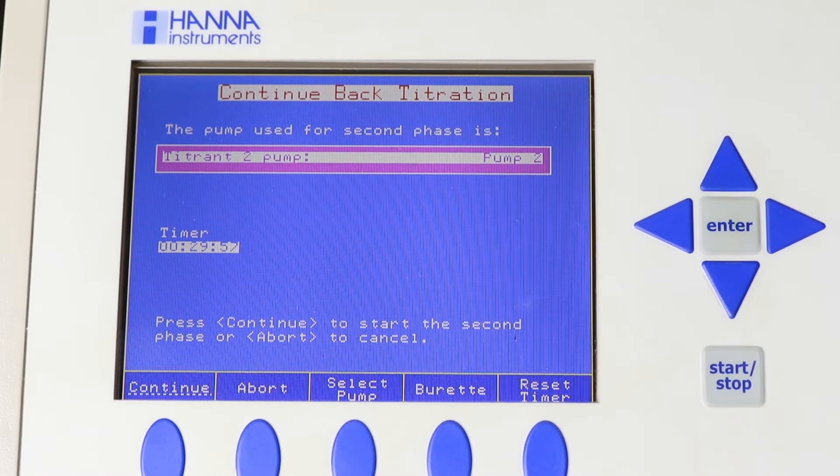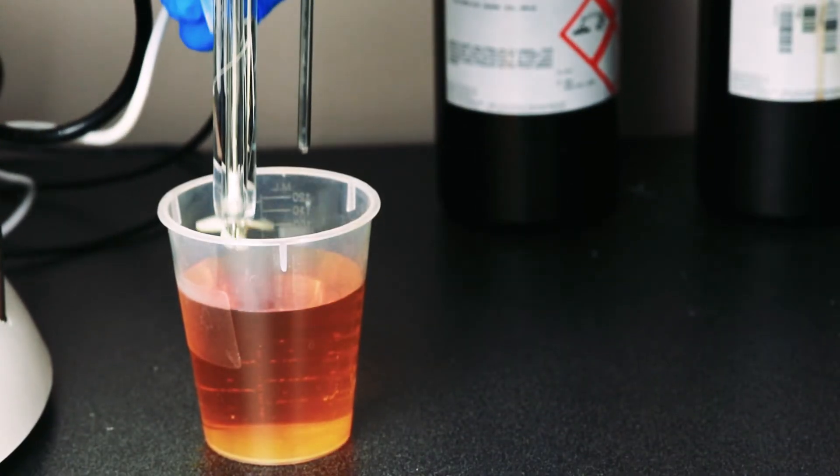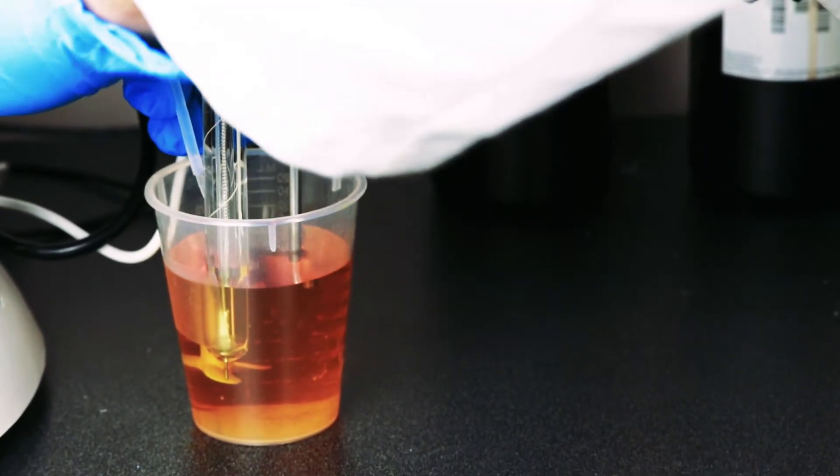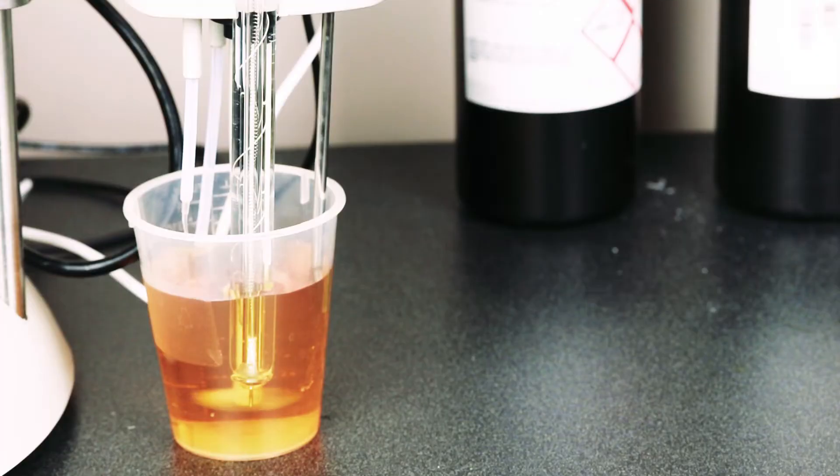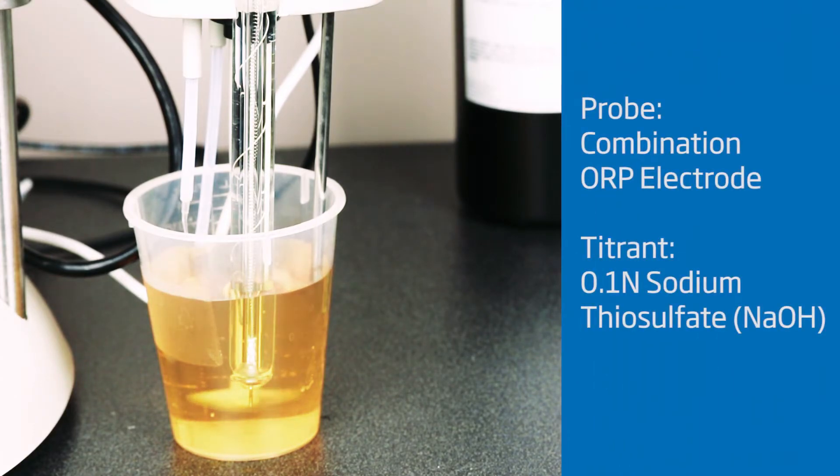After the 30 minutes have elapsed, submerge the stirrer, dosing tip, and electrodes into the beaker and press start. The titrator will then back titrate the excess iodine.